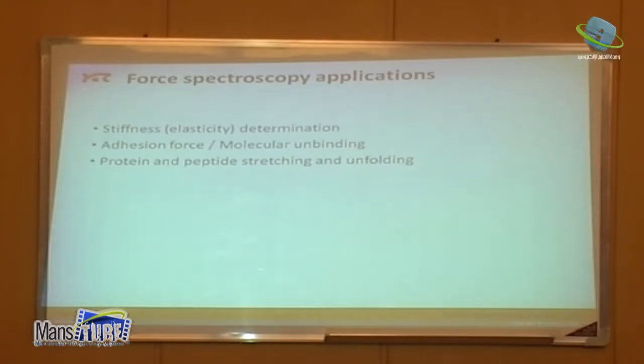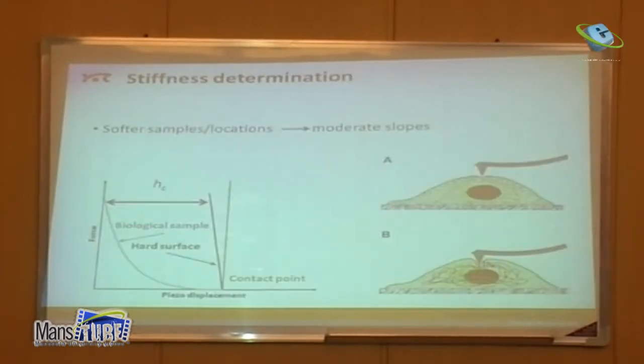This is something about single cell spectroscopy. So you can go to the surface, touch a molecule, for example, and you can take it out, and then you can measure how it changed on the surface. This is what I showed you yesterday.